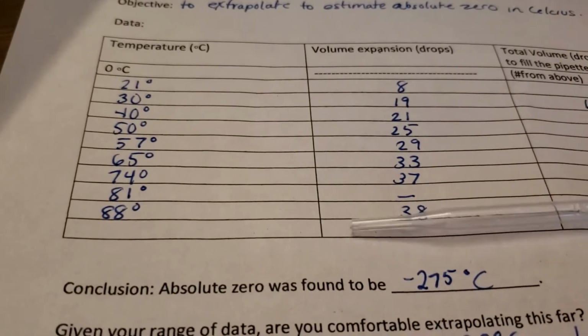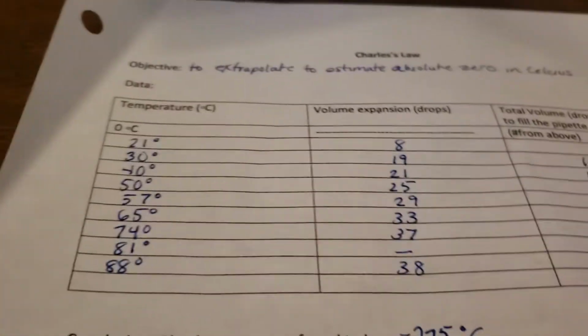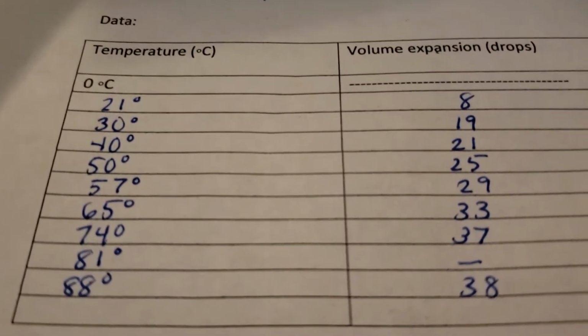Okay, so then to collect the data, what you do is you would put your micro pipette in varying temperatures of water. The coldest temperature I used was 21 Celsius, right?